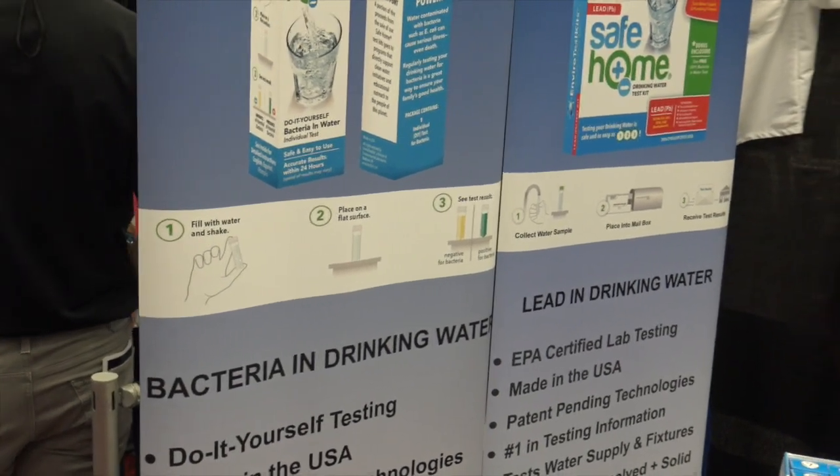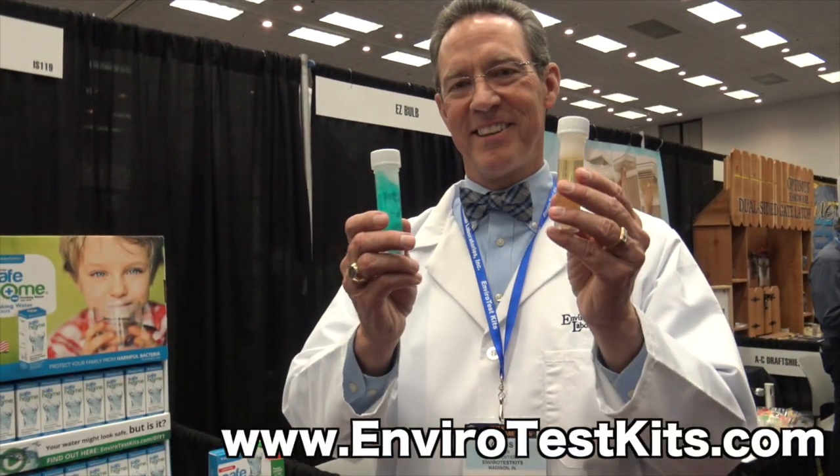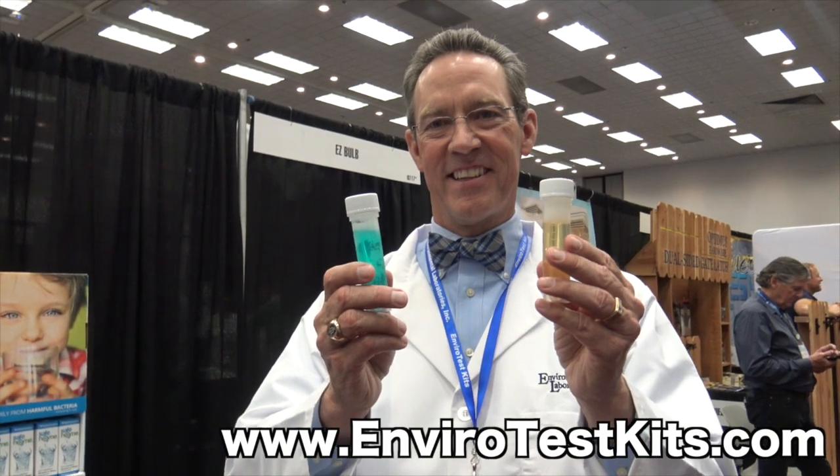If it's yellow, it's negative for bacteria. If it's green — the teal color — it is positive for bacteria. A homeowner can do this anywhere in the world. And you had two-year shelf life on your kit samples right there.